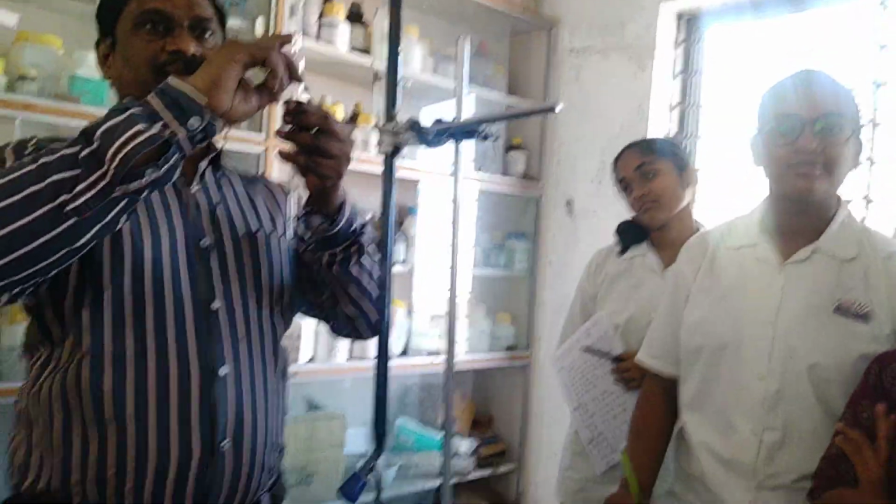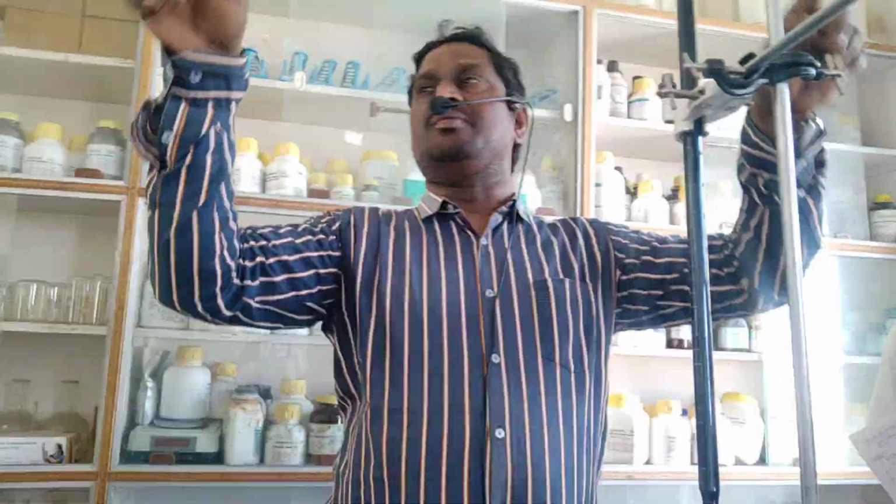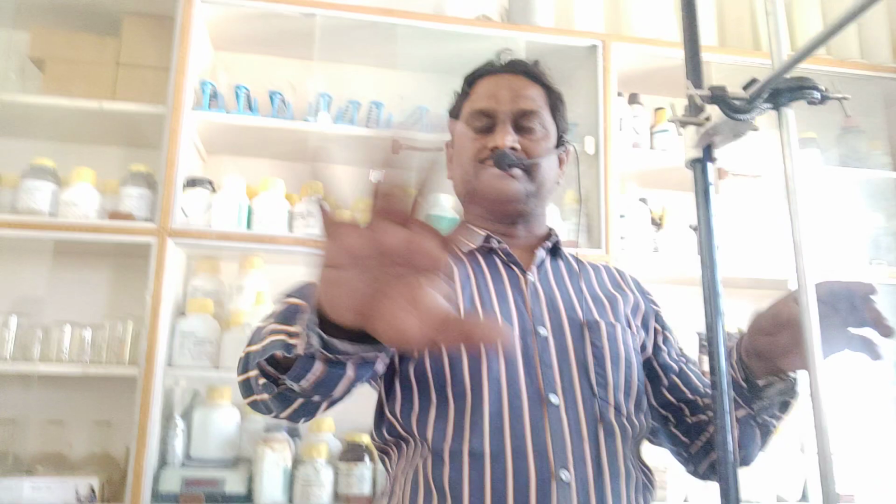This is called the pipette. So like this we perform the experiment. We have 4 models here. Thank you.